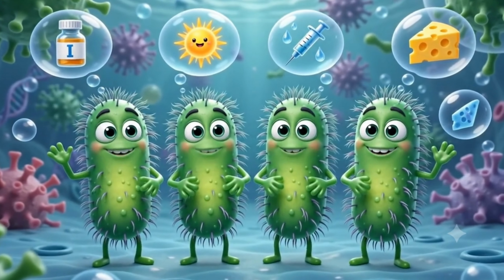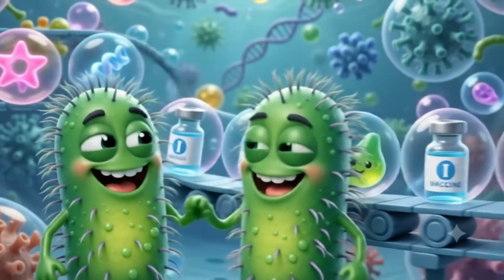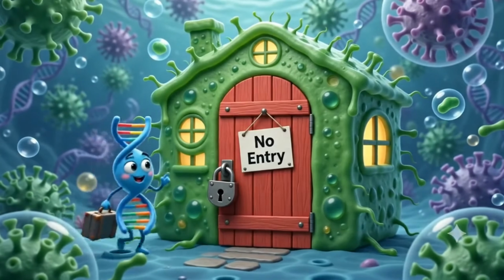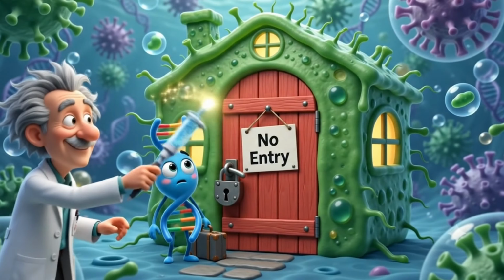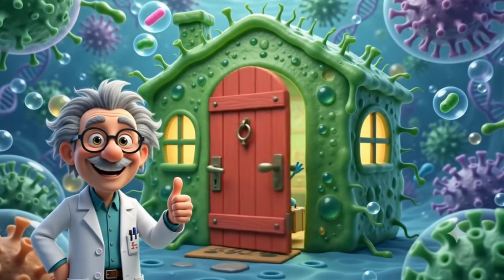Scientists use transformed bacteria to produce medicines, research proteins, vaccines, enzymes, and many biotechnology products. Normally, bacteria don't easily accept foreign DNA. First, scientists must prepare competent cells. These are special bacterial cells that are ready to take up DNA.